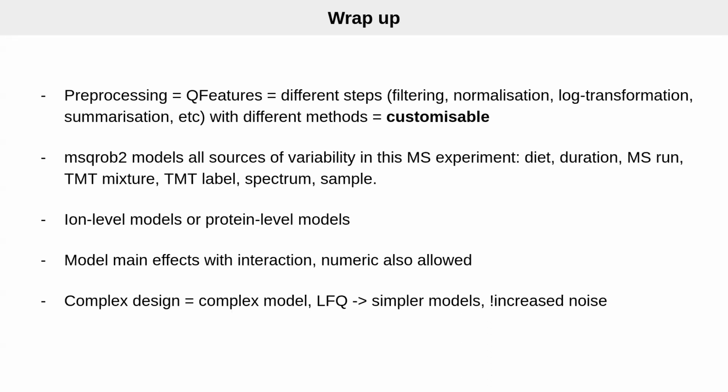The design I just showed you today maybe was a bit overwhelming. I think it's interesting to see how complex a dataset can be. It can even get more complex if we think about single cell proteomics data. Here we also have to take into account that every cell comes from a subject. So cells coming from the same subject are expected to be more similar than samples coming from different subjects. But you can also have much simpler models.